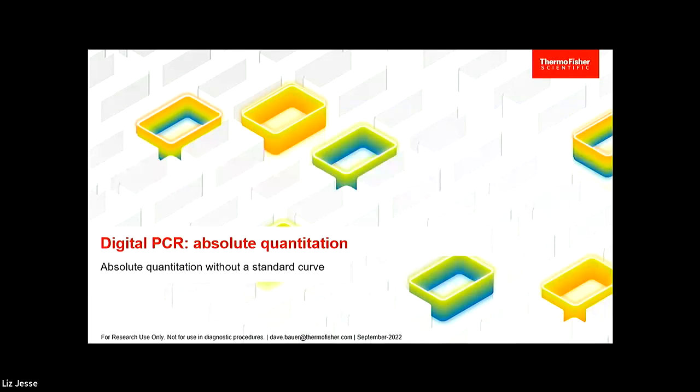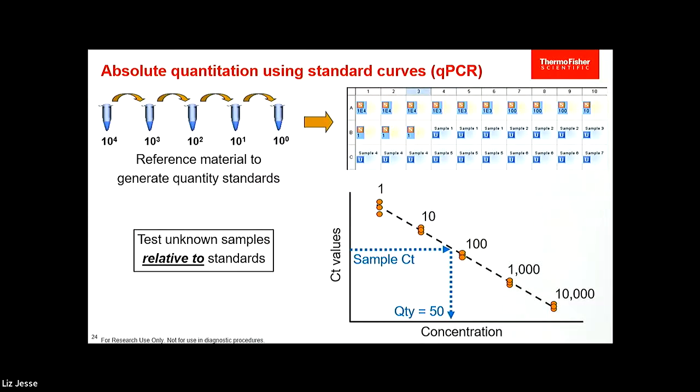All right, we'll start with absolute quantitation. For those of you in the room that have ever used a standard curve with qPCR, you know that it has several challenges. The first challenge is when you create your standard curve is finding that standard. Sometimes the source material is not as available or easy to find as others. Also, how does it relate? Is it a pure form and yours is an environmental form? Is it an oligo versus yours is more naturally occurring?